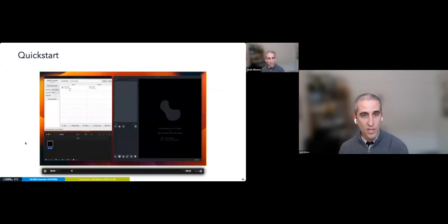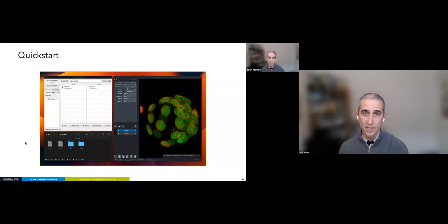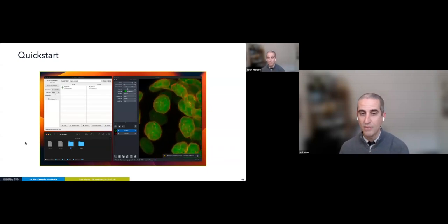And it looks like this, so that once you open the application, you can drag your data onto it. You can hit run conversion. You get an OME-Zarr, and then you can open that in applications, right? So not really that much different from BF Convert. It's exactly what you would want. It should look the same before and after.